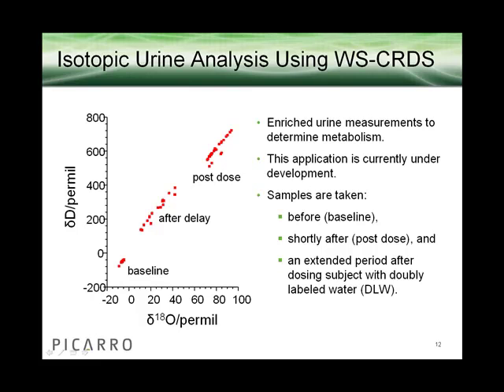One of the factors important in these labeling applications is the linear dynamic range of the instrument. There are many potential preclinical applications for this type of analysis.